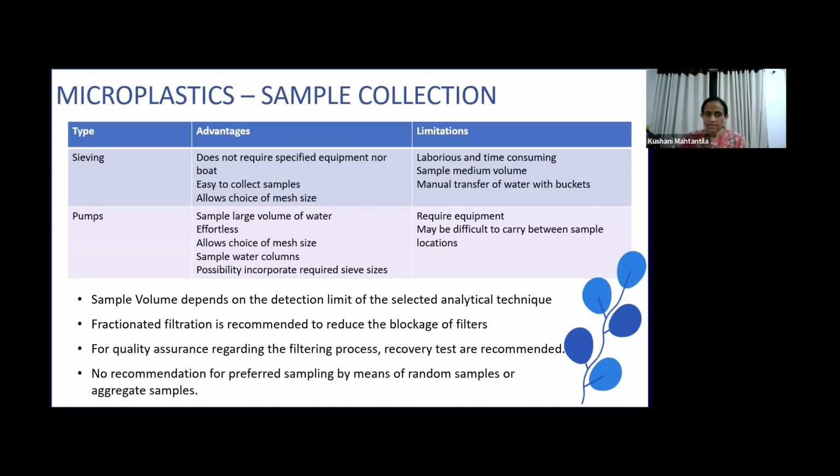As I discussed earlier, sample volume depends on the detection limit of the selected analytical techniques. And in the standard 24187, fractionated filtration is recommended to reduce the blockage of filters. That is, you can use different mesh size sieves to filter the water. The mesh size can be selected according to their particle size classification.